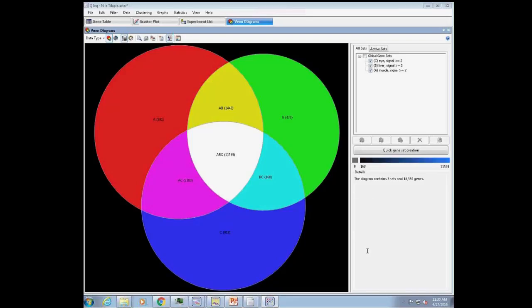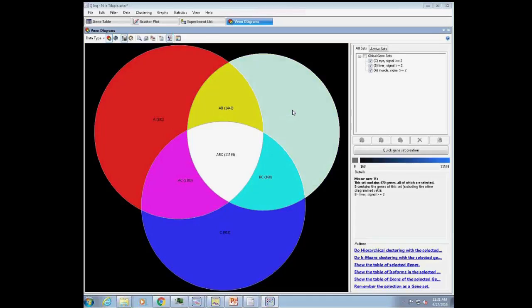So this is, again, very different tissues. So in this case, the transcriptomes don't overlap that well. If we did whole organism here, you'd get much more similarity between the 3 different sets. But because these are specific tissues, we're going to have many different genes that are expressed in one tissue, not the other, and certainly different isoforms expressed in one tissue versus the other. So you'll see that the Venn shows, while there are a lot that have in common, each tissue type, so here's liver, has a subset of mRNAs that are expressed just in that tissue type, at least above the threshold that we picked.